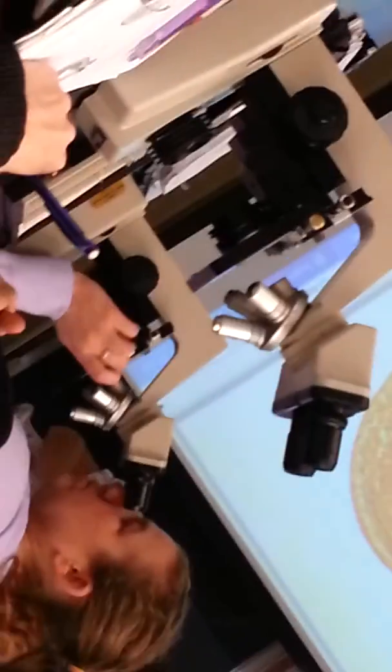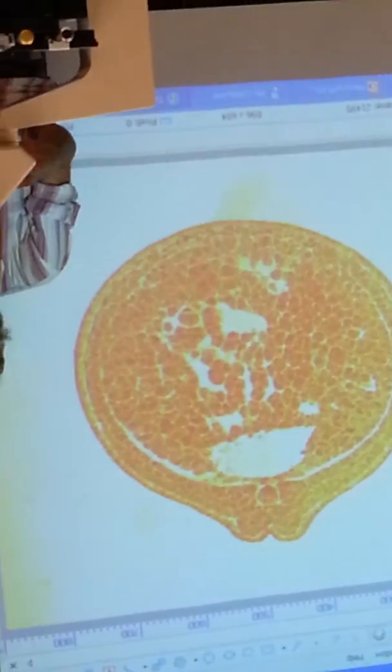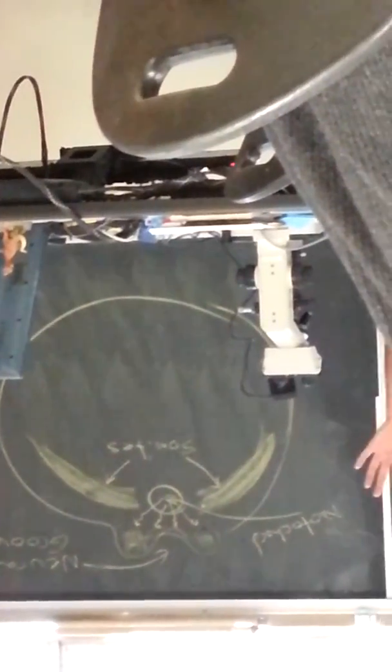There's one other thing on this slide, though, that I want to point out. Do you basically see the direction that you're going from this slide to a dorsal hollow nerve cord, first of all? And we'll look at the next slide, and that'll help confirm that. The next thing that you're seeing here is, flanking the notochord, two long triangular strips of tissue here and here. See if you can find those on yours. There should be two skinny triangular strips of tissue flanking the notochord.